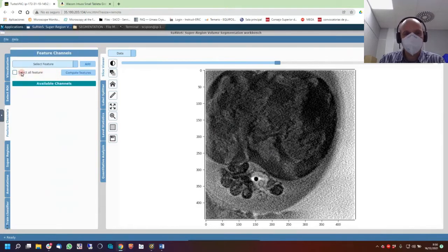The best thing that normally works is a Gaussian filter. So apply the filter that you want. I have a question. Javi, all these tools, do they replace the original tomogram, or do they create a kind of extra layer that you can use to help the segmentation?